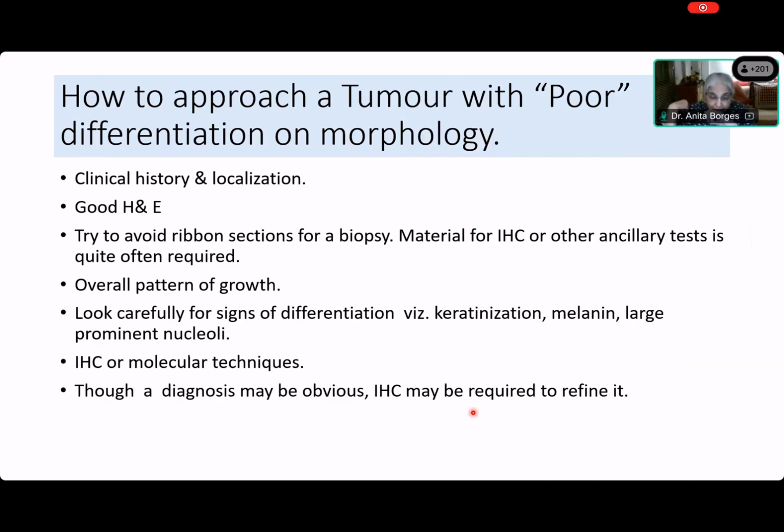Okay, if you've got a biopsy, for you as postgraduate students, you never bother about this. But those who are in practice, if you've got a biopsy, please don't take ribbons. Ribbons are taken just like that, beautiful arcs in long rows. You know what is a ribbon? They just tuck and cut all the wax and put the sections on the slide. Please don't do that, because when you have poor differentiation, and there are some sites where you expect poor differentiation, in the nose, paranasal sinuses, sometimes lymph nodes, our needle core biopsy should never have ribbons, okay? Because you need material for immunohistochemistry and other ancillary tests.